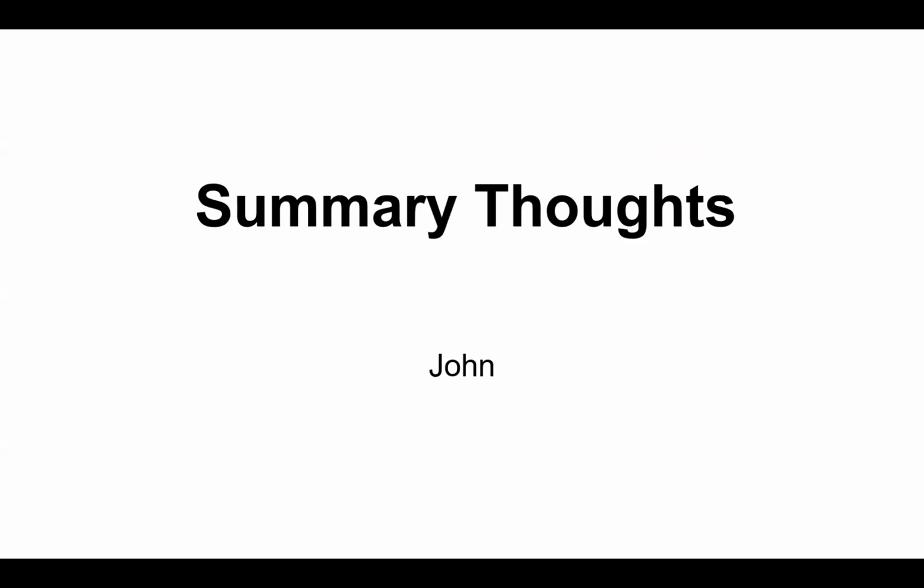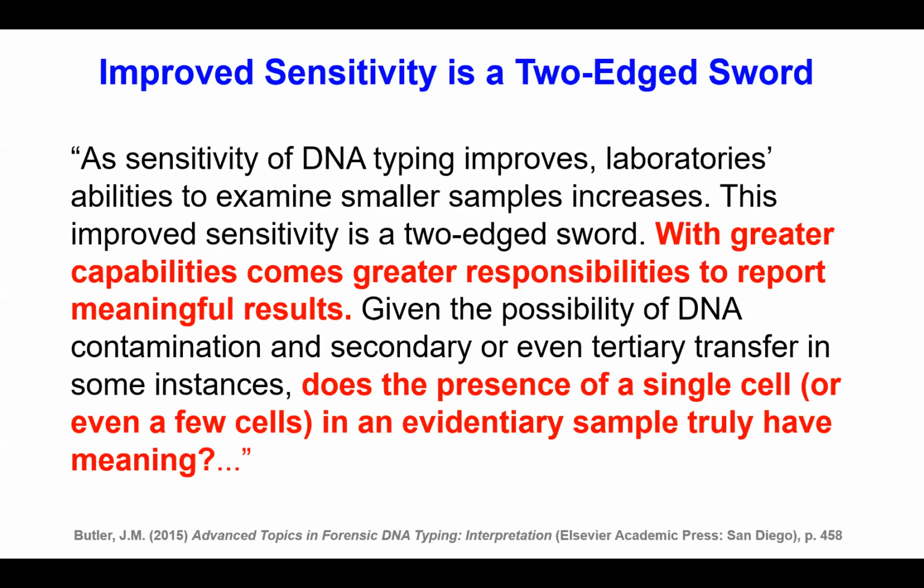I have a few summary thoughts, and then we'll take time for questions. One of the challenges that exists with the growth of DNA is the ability to become more sensitive. In the last decade, we've had sensitivity improvements. This is one of the things I wrote in my last book on interpretation: as the sensitivity of DNA typing improves, laboratories' ability to examine smaller samples increases.